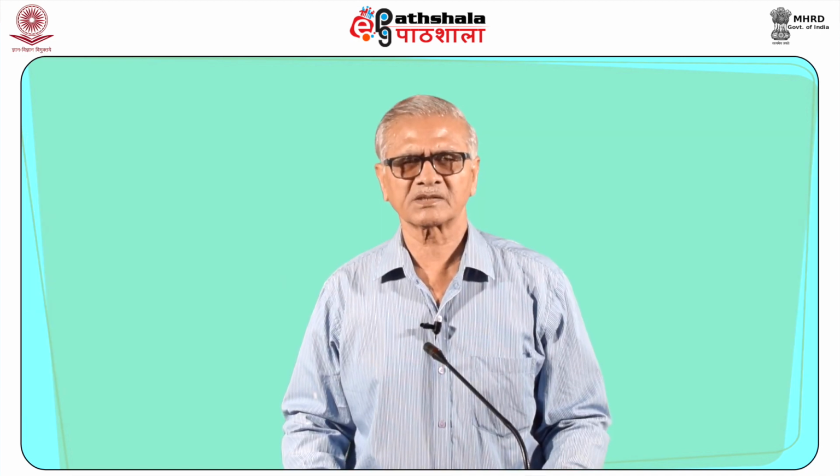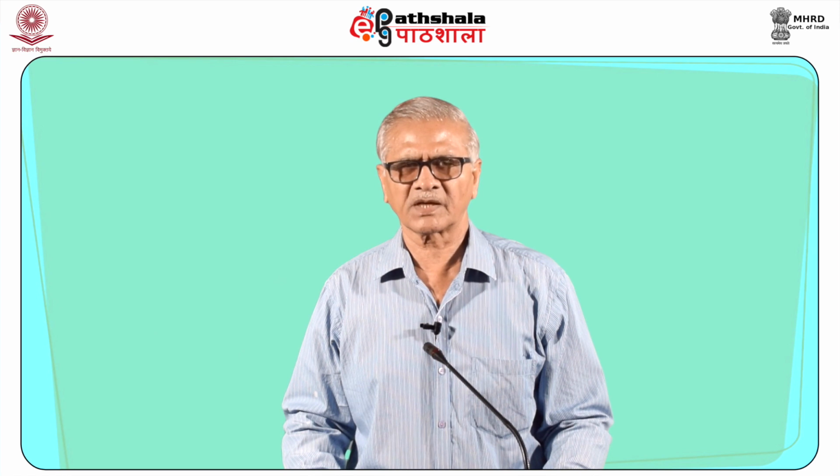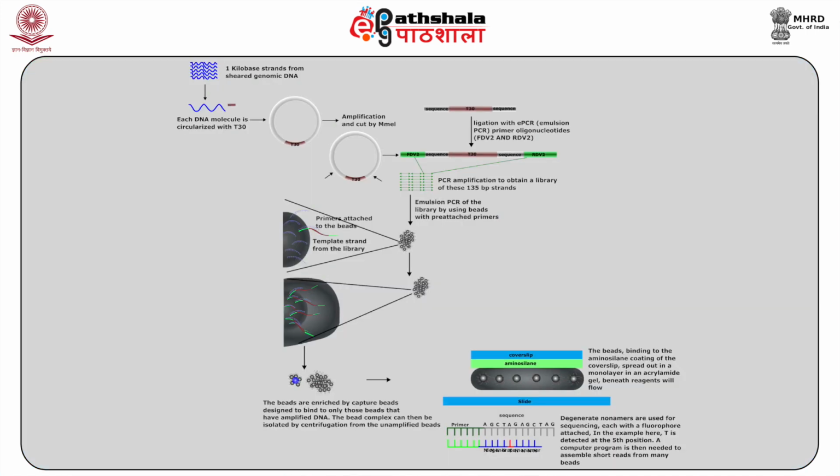Several bases in 5' to 3' direction and 6 bases from the 3' end can be queried in this manner, resulting in a read length of 26 bases per run, 13 bases from each of the paired tags, with a 4 base to 5 base gap in the middle of each tag. Figure shows various steps of Polony sequencing technology.